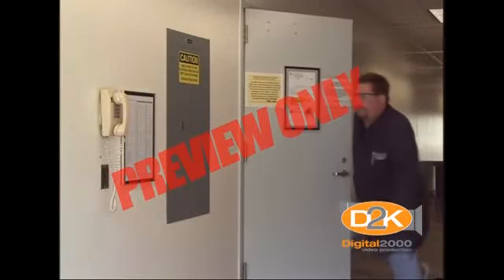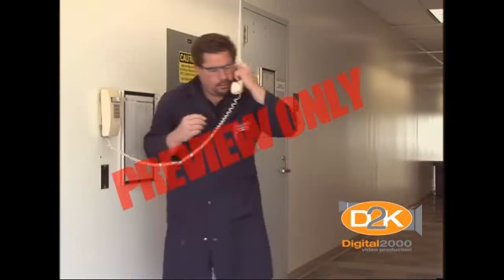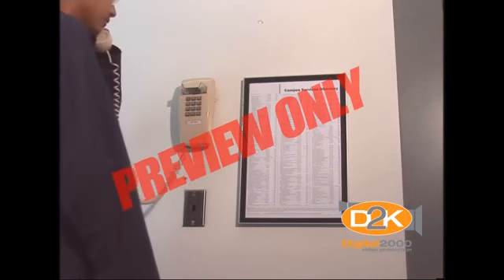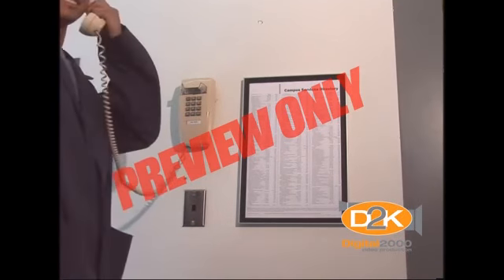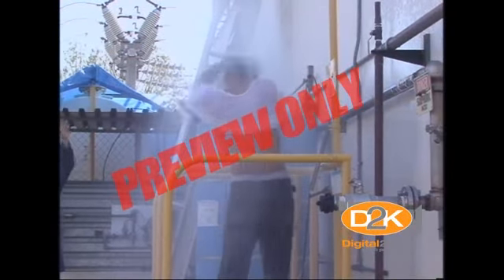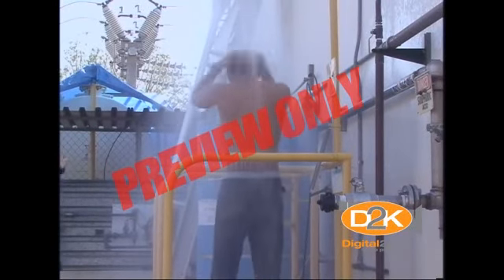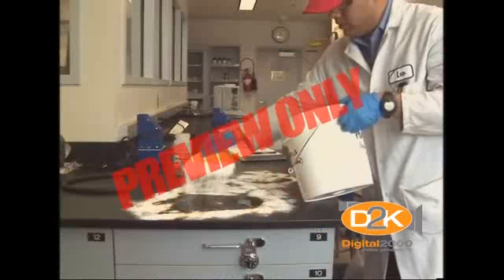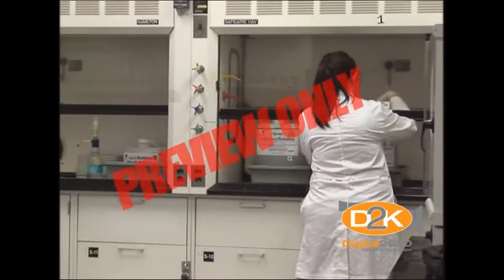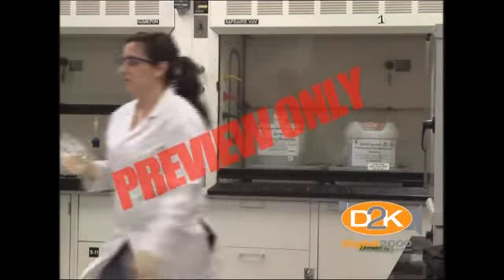If you are working in laboratories or laboratory support rooms, you must have access to a telephone that can be used to dial 911 during or after routine work hours. Emergency contact information should be available near the laboratory exit. Each laboratory should contain or have easy access to safety equipment, including emergency showers and eye wash stations, first aid supplies, spill supplies, fire suppression equipment, and chemical fume hoods. Additional safety equipment may be required depending on the substances used and procedures performed.